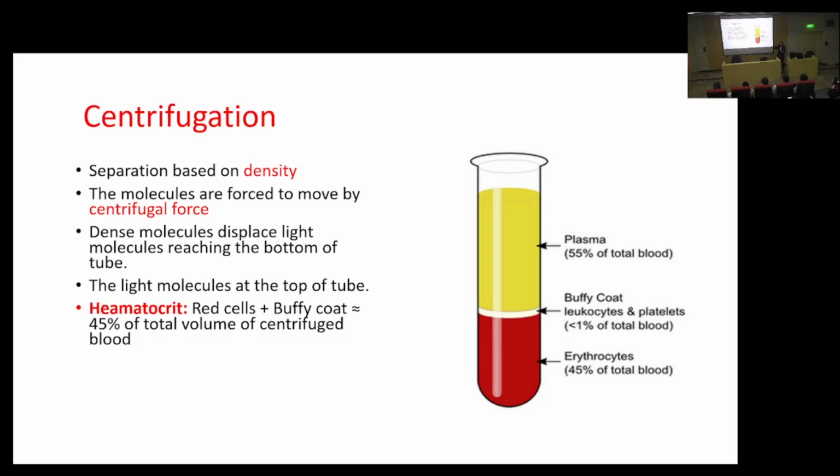So if you have a blood sample, for example, you can use centrifugation. You can put the blood in a tube. That tube, you will put in a machine called the centrifuge machine. It'll spin it so fast. Imagine I have a rock at the end of a string, and I'm rotating it this way.